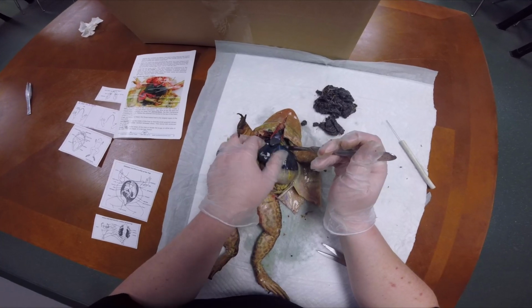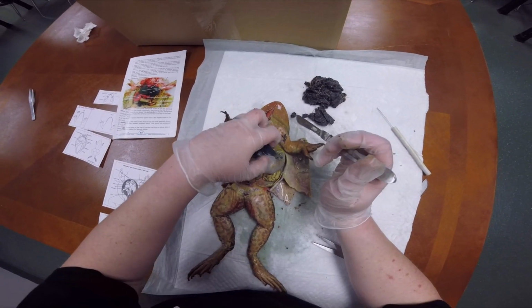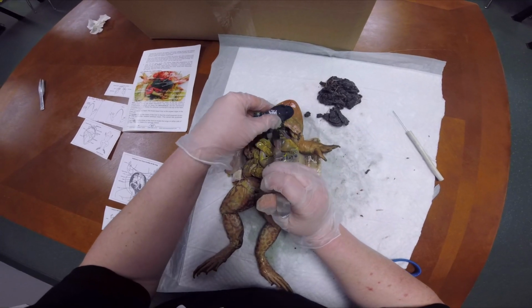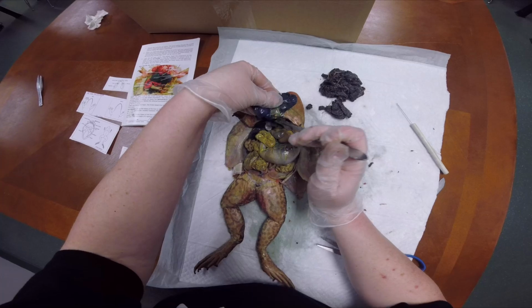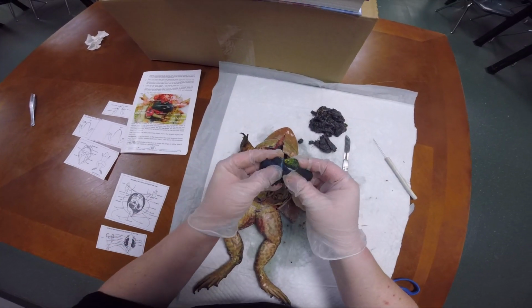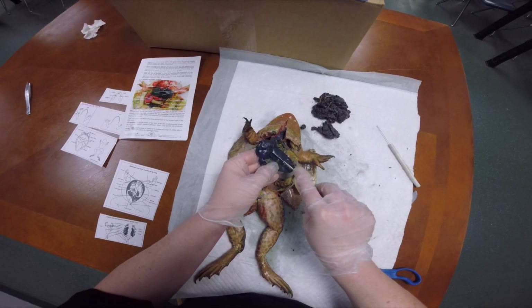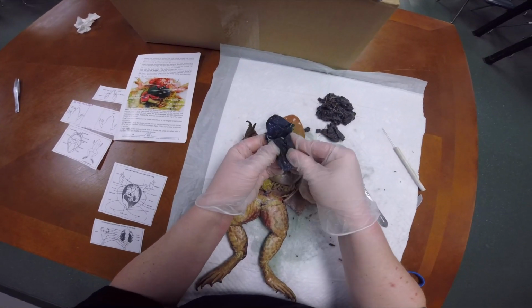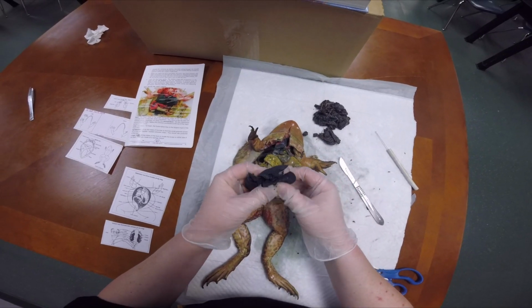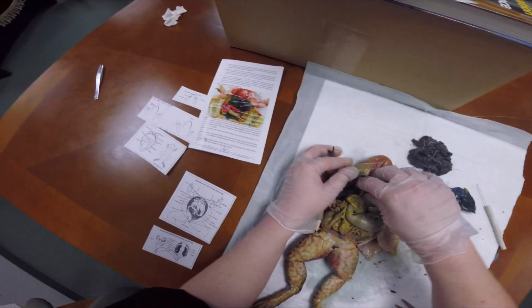It wouldn't normally be blue, but since we have the dye, it is blue for us. Taking that out, that's the liver, and if you open it up, it kind of looks like blue Play-Doh.